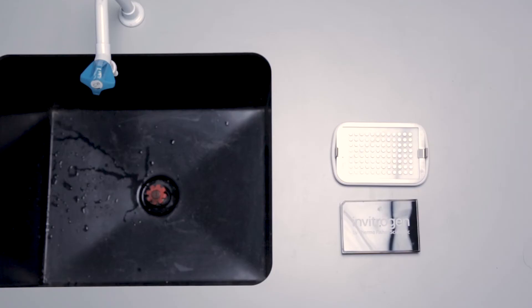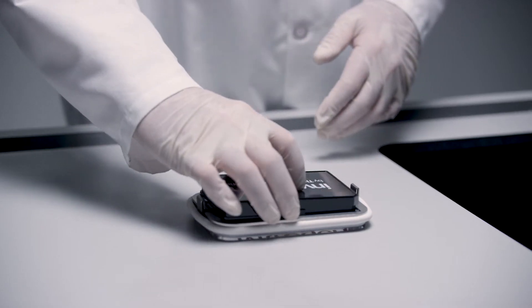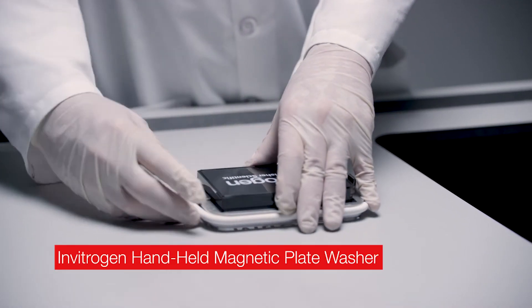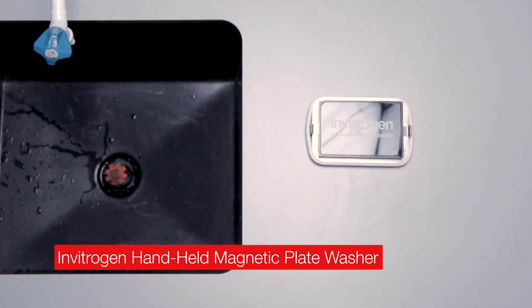For optimal performance, we recommend using the 96-well flat bottom plate that is provided with the ProcardiPlex assay. Take the plate and insert it into the Invitrogen Handheld Magnetic Plate Washer and lock the clips.